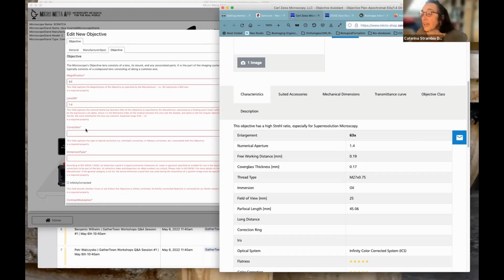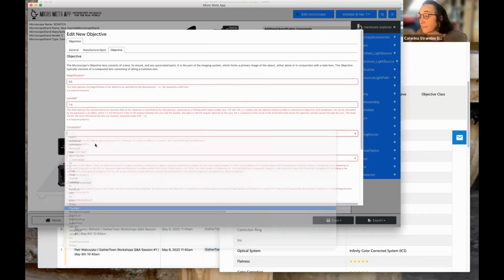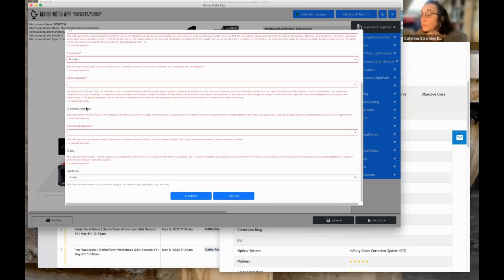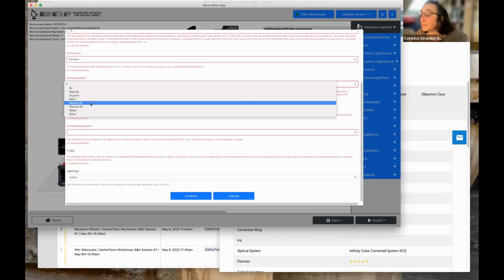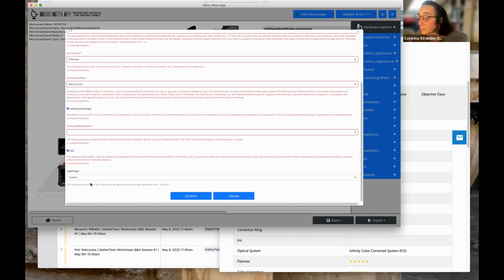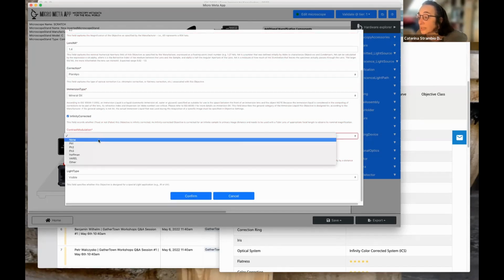And so once you have entered all the information, you can then validate, and that's it.